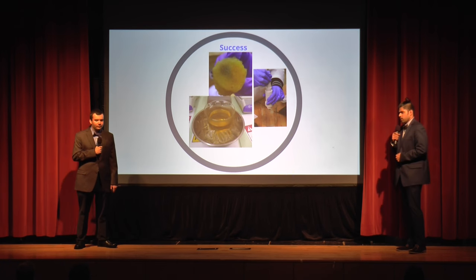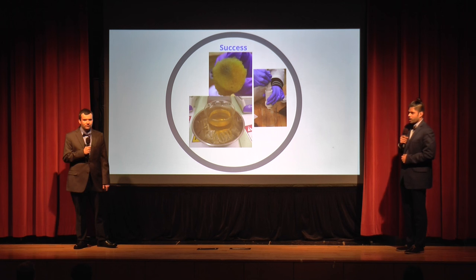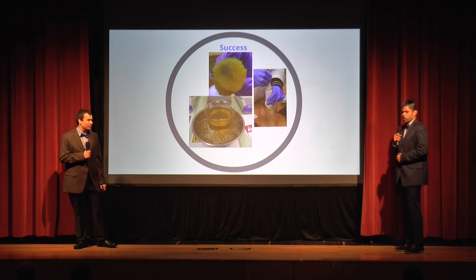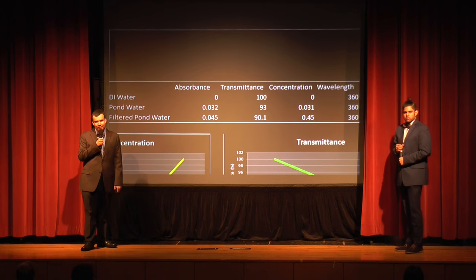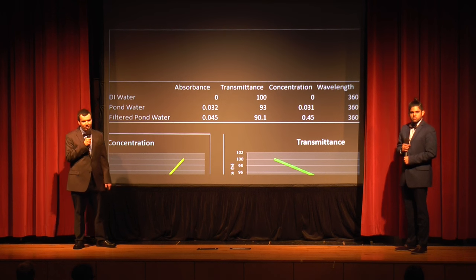Finally, for our third experiment, we actually used the trisodium citrate that the actual article we read recommended. And we actually got the solution to turn yellow. And in order to keep it yellow, we actually put it in an ice bath. And these are the results that we got. We used a spectrophotometer to record our data.